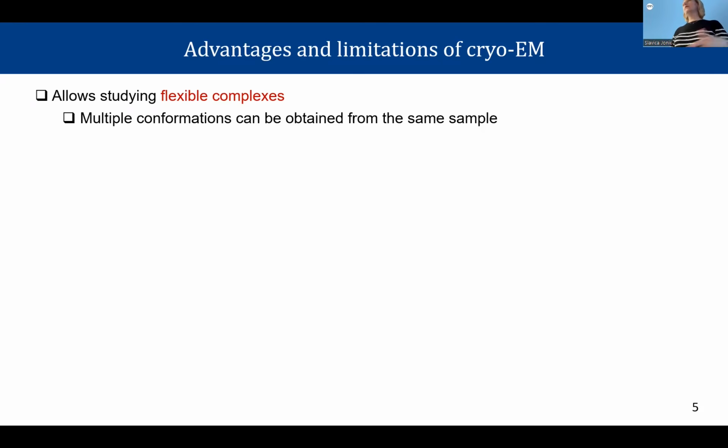And ideal to get the full set of conformations. When I say full, this supposes that you understand the shape is changed not in discrete states, but continuously. So you have gradual changes. Of course, when we collect the data, we never can be sure what we are extracting, and whether we can really pick all these conformations, because there are some conformations that the complexes will prefer.